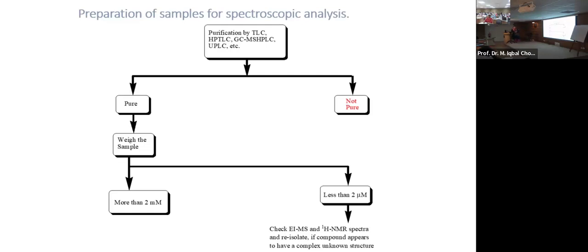Let's talk about small molecule NMR. If you have a sample with you which is a small molecule, it usually means organic molecules. These molecules are very small, usually a few hundred daltons, not more than that, say 300 daltons or maybe 600, or at most, if it is a bigger structure like a dimer or trimer, maybe 800 or 900 daltons.